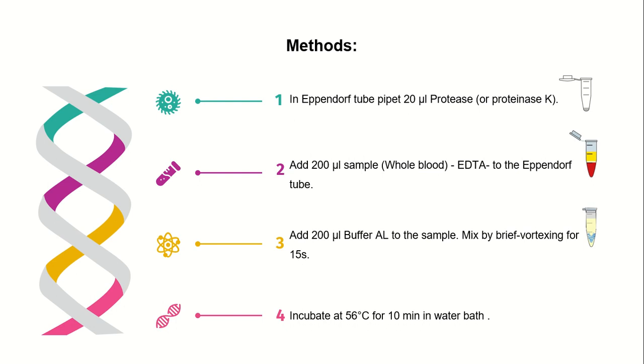Then add 200 microliters of buffer AL to the sample.